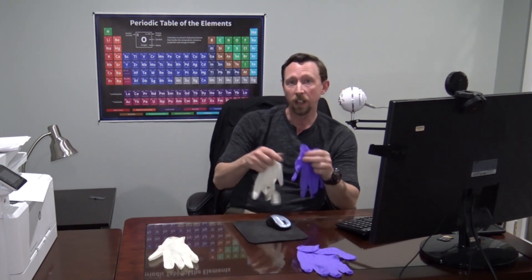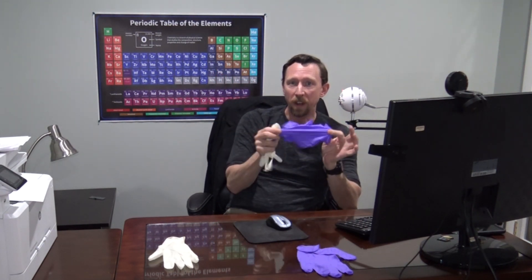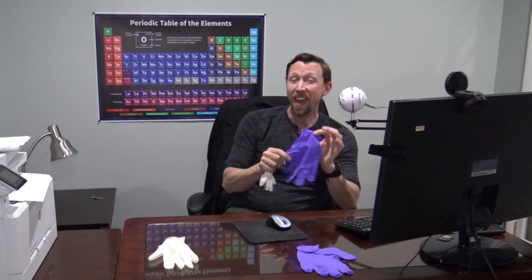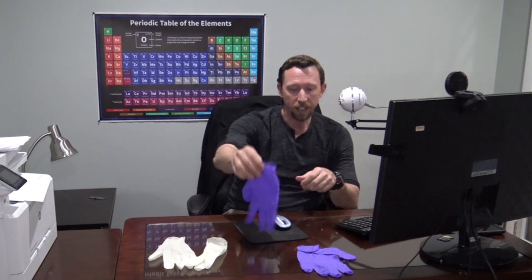I've got two different versions here. These are latex protective gloves, made from natural rubber. The other type that you might find that are very popular these days is nitrile rubber. Nitrile rubber is synthetic, and because of that, the few folks who have allergy issues with latex don't have to worry about that — they can use nitrile gloves like these.